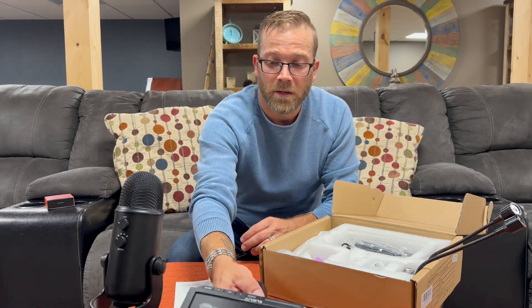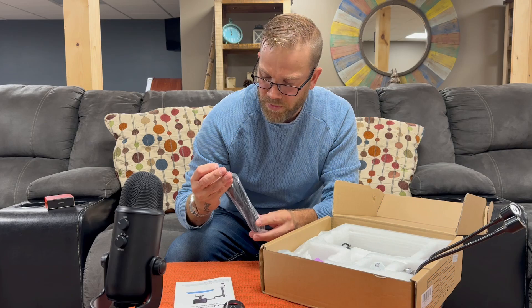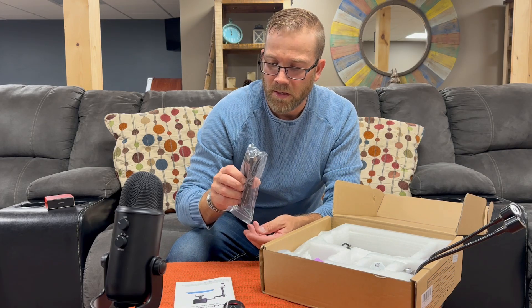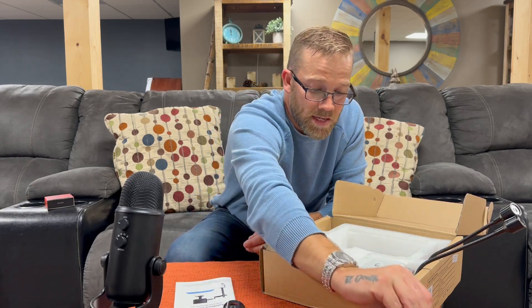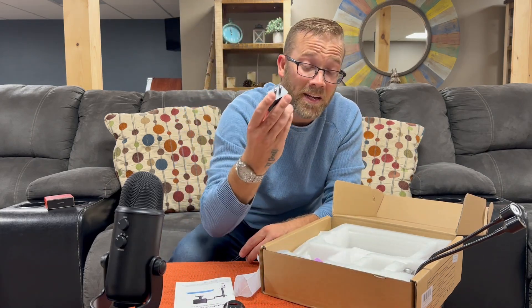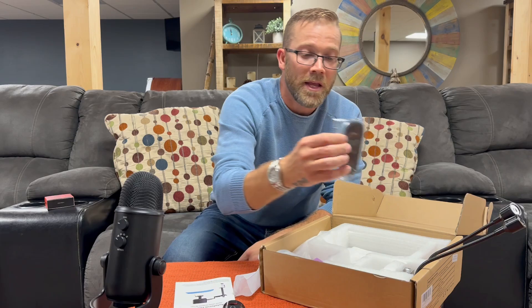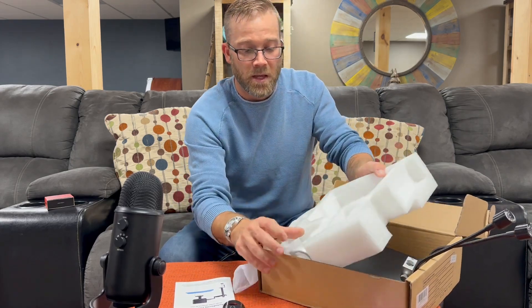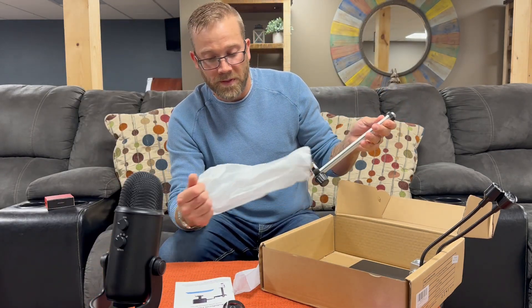We have an 8-inch screen, 4K high definition. Here are the cables — this is the USB-C for hooking to the computer, another USB-C, and one for power. It's nice that it comes with the cables. We also have the remote control — batteries are included — a little screen wipe, very nice. All of that came packed in the foam, and here's what we have underneath.